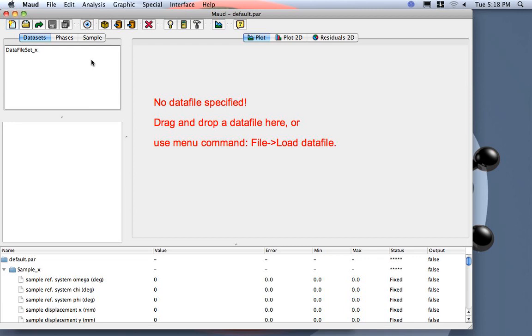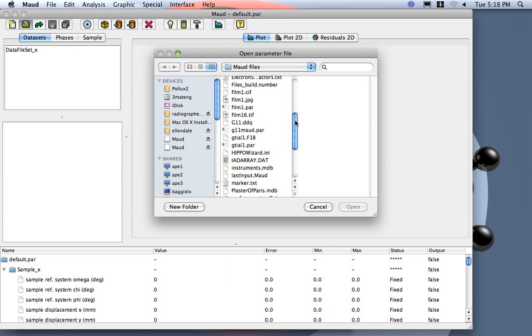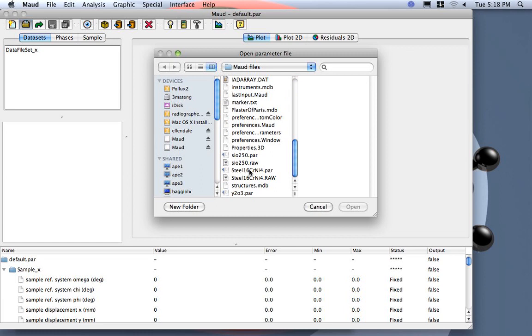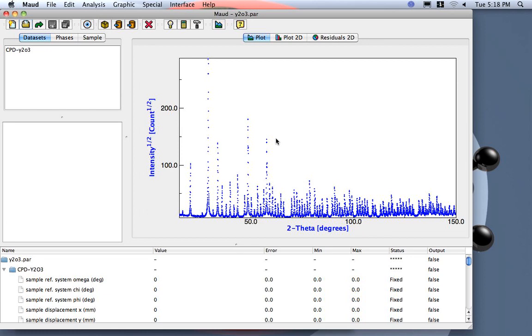I would like also to check if everything is ok so I just load one of the examples. Maud goes to the directory I created. There are a lot of files inside. The ones ending in .par are analysis examples already done. You can load one, for example we load this yttrium oxide that is just an example coming from a round robin.